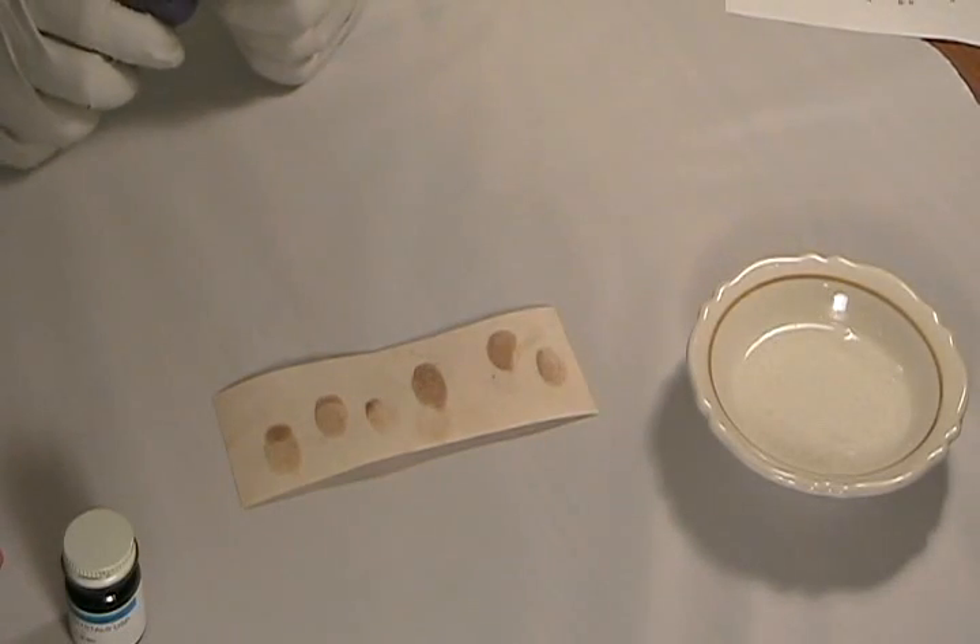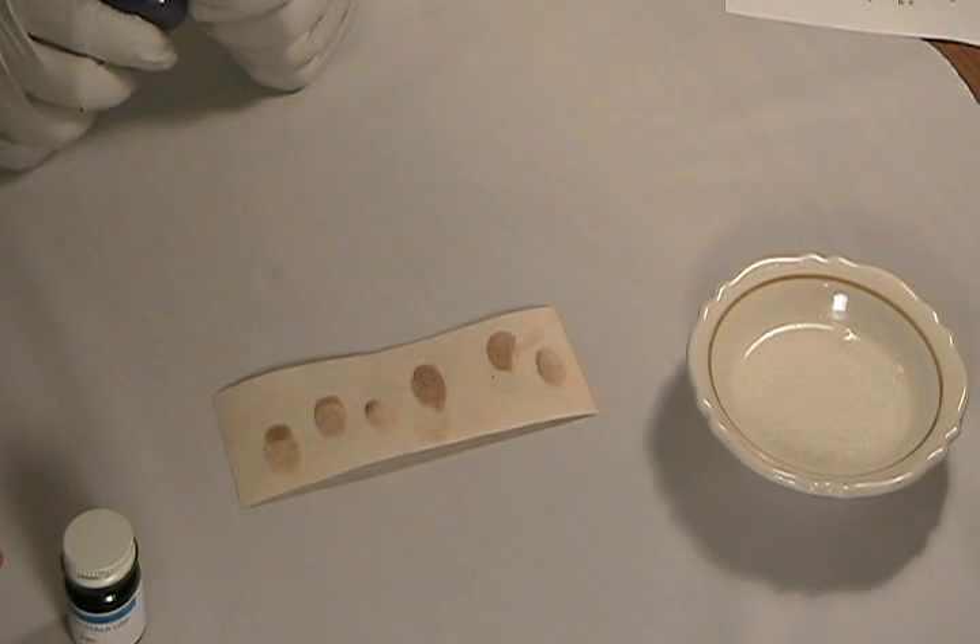These stains are fugitive — that is to say, they will eventually disappear in a matter of hours to days, or a shorter period if you treat them in the oven. This is actually a good thing about iodine because it means the process is completely reversible. If iodine doesn't work for developing latent prints, you can use another method subsequently.